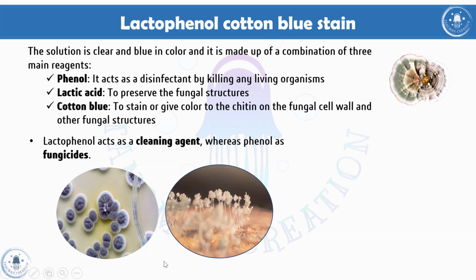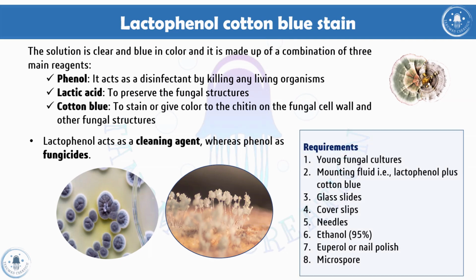The structures you might have seen growing in your plates include molds, yeast, and mushrooms. Some fungi are also edible, like mushrooms, and like yeast, which is used in bread making, in bakery. They are common contaminants that we can find in our microbiology lab.